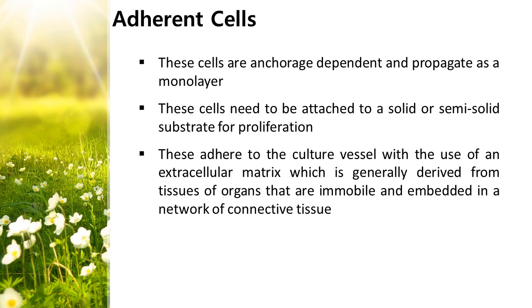adherent cells. So the name itself indicates they have to be attached to the surface. So these cells are anchorage dependent. They grow or promote their growth as a monolayer. Just imagine that over the surface of water some layer has been present. So these cells need a solid support, or a semi-solid substrate is required for the proliferation. Proliferation is nothing but growth.